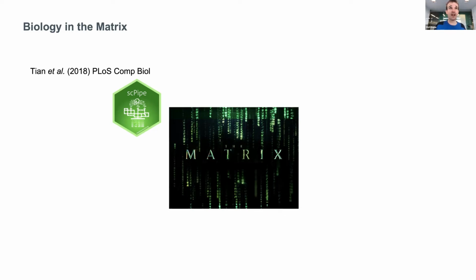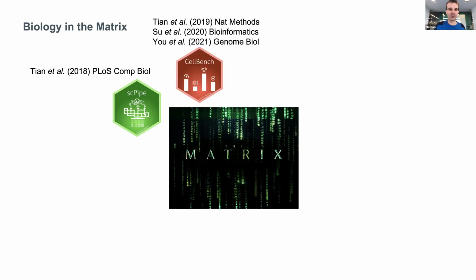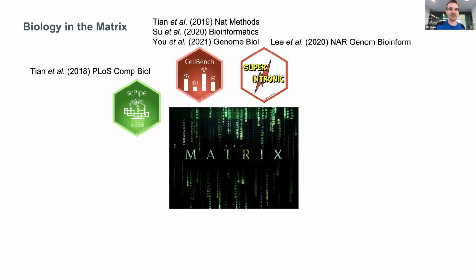And then with the proliferation of lots and lots of different single cell methods, we looked a lot at benchmarking. So developing software to handle lots of different combinations of normalization, clustering, trajectory analysis, and so forth. Thinking about different ways of collecting information that might otherwise be discarded, like intron counts, is one thing that we wanted to explore in more detail, and we have software for that.